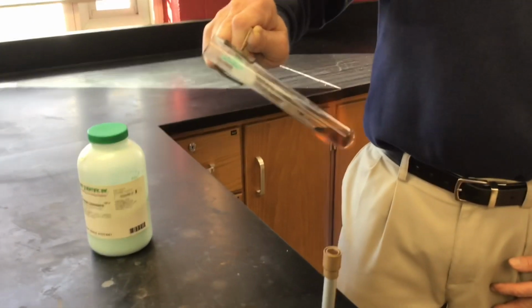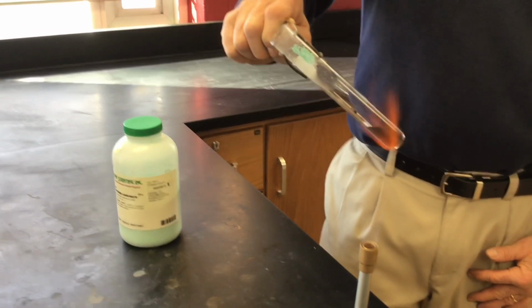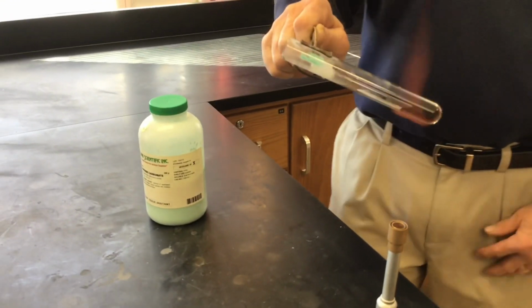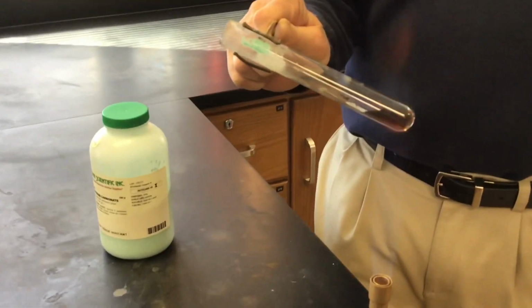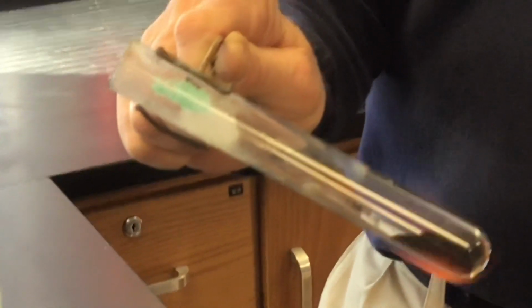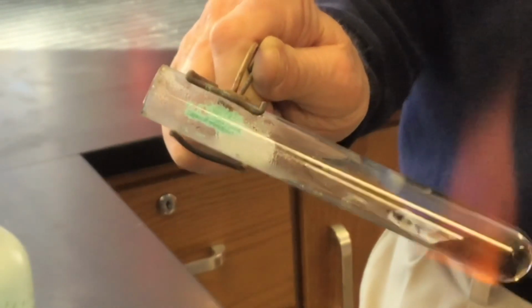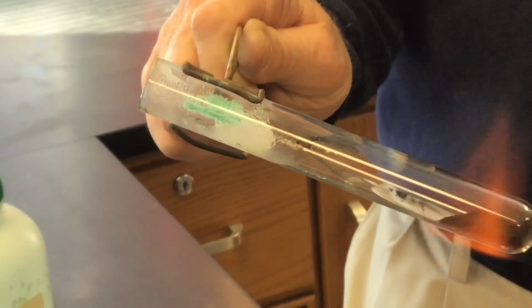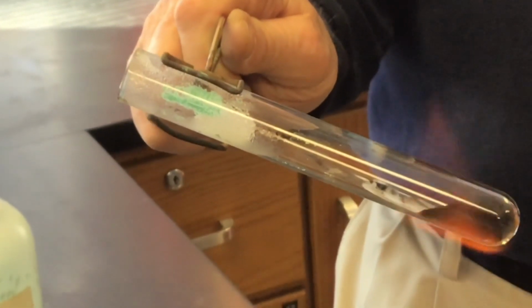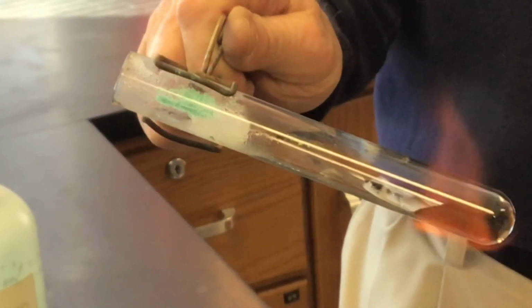So we see that a change has happened. Looks black. It was green. You can see some of that green up at the top of the test tube. And if I can try to zoom in on the test tube also, I don't know if I can get a good clean shot. Look at the inside of the test tube. You see it? A little bit. Looks like there's some condensation. Yep. Looks like there's a little water vapor at the top.